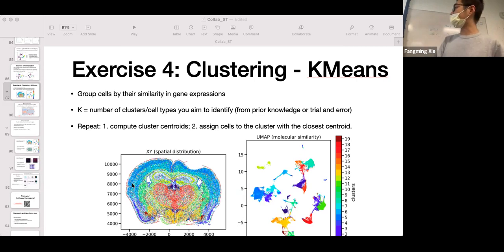So another thing to do, if you want to understand how different cell types here are different from each other, you want to highlight their relative differences for each gene instead of between-gene baseline differences. So we can do some improvement on it. One thing we could do is called z-score for every gene. So renormalizing the expression range for every gene so that the cell type with the least expression is about -1, and with the most expression is about +1, and the mean is around 0. That's what z-score is doing.